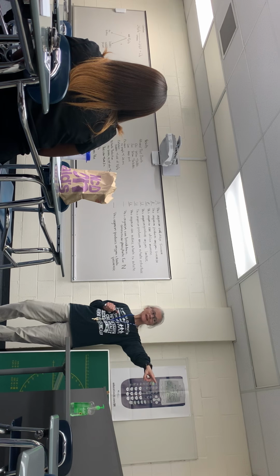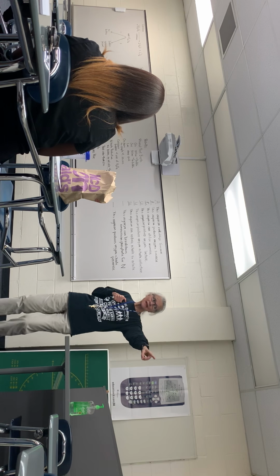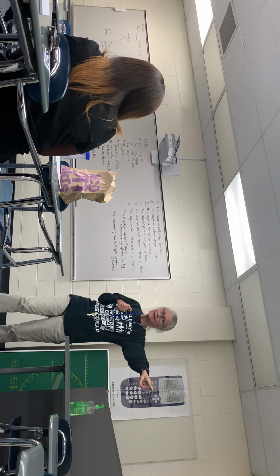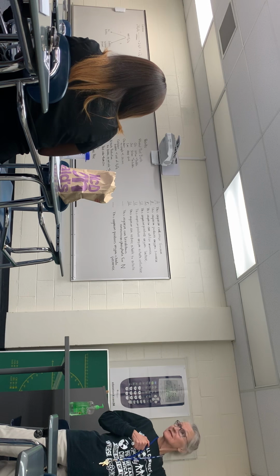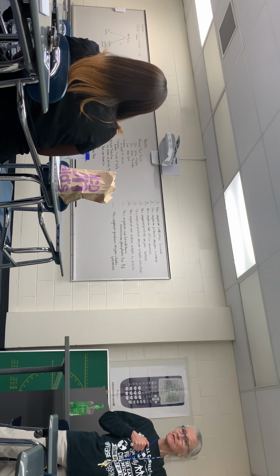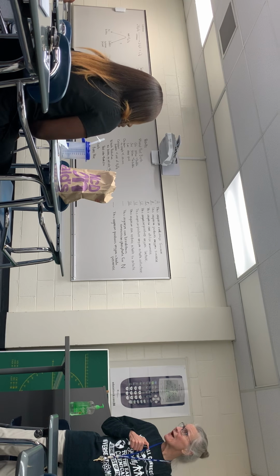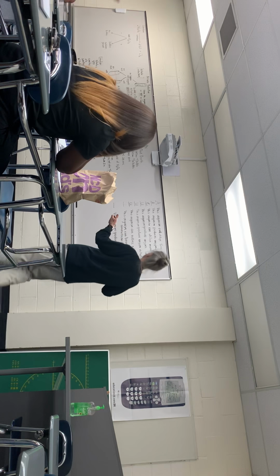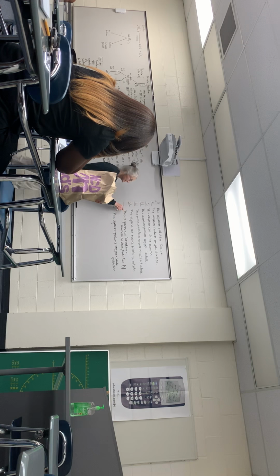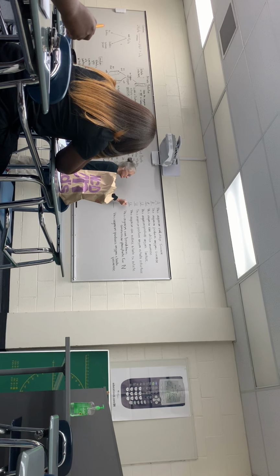So what does it mean if it turns blue? That's positive, but that also means that the medium is alkaline. That means it's using the ammonium phosphate for nitrogen. That's what makes the medium turn alkaline. So that would be a true statement, so that would be acceptable. This is actually what makes it turn blue, the utilization of that ammonium phosphate.